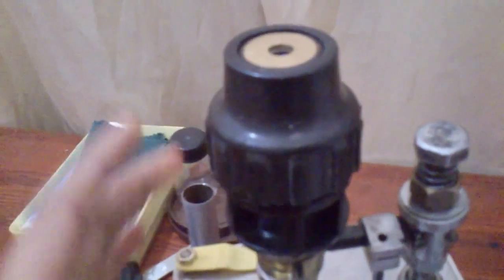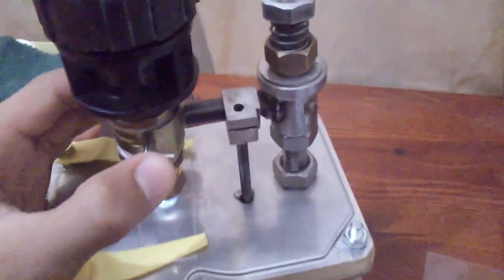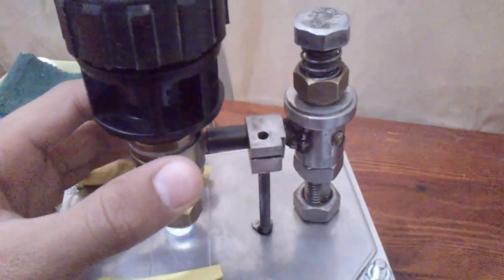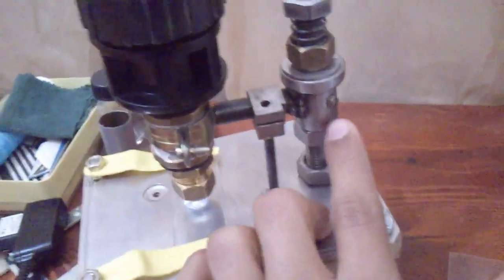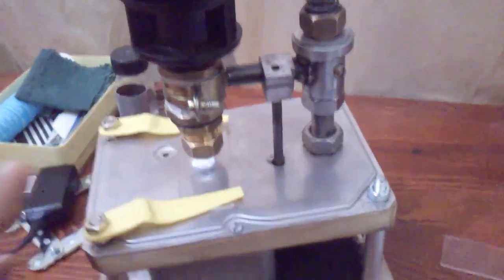This is the optic part and this is the mechanic part. At first it was having a problem - the optic part was shaky. Then I added this screw right here and this little modification to the bolt that will stand the optic part in its place.